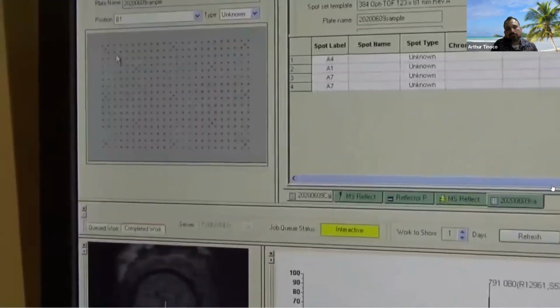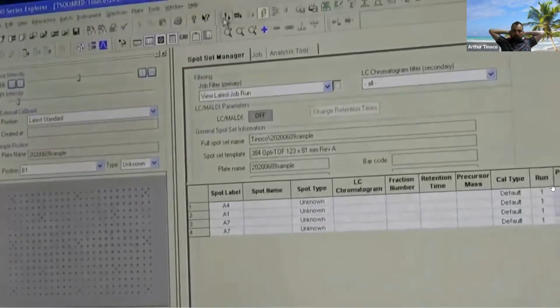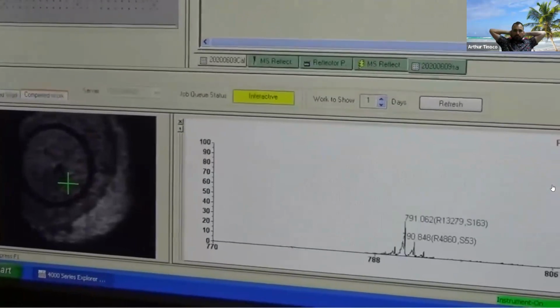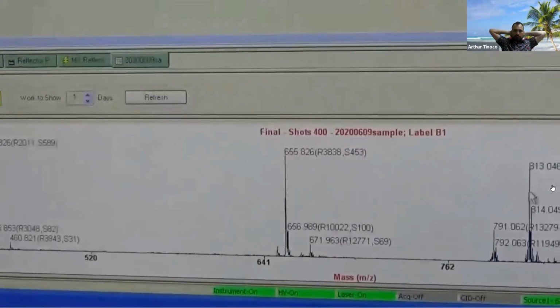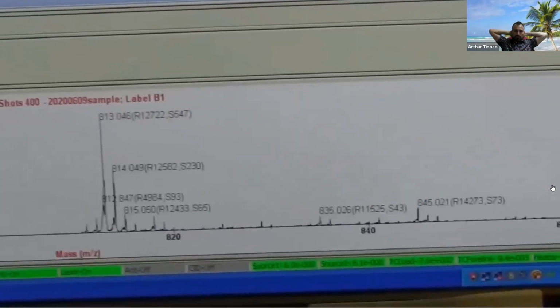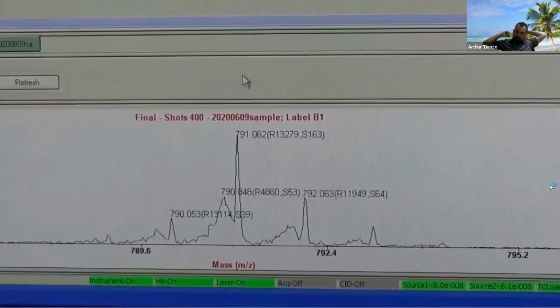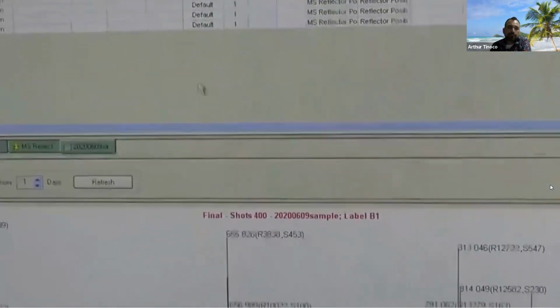Finally, we will collect data for the sample that was prepared by first crystallizing the MALDI matrix, and then on top of it, crystallizing our sample. Here we see the two ion peaks, but the quality of the ions is simply not as good. This is not always the case. There are many examples where this method works quite nicely, but in this particular example, it did not work very well at all.